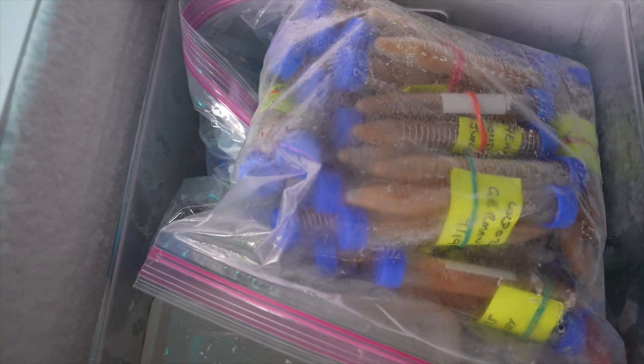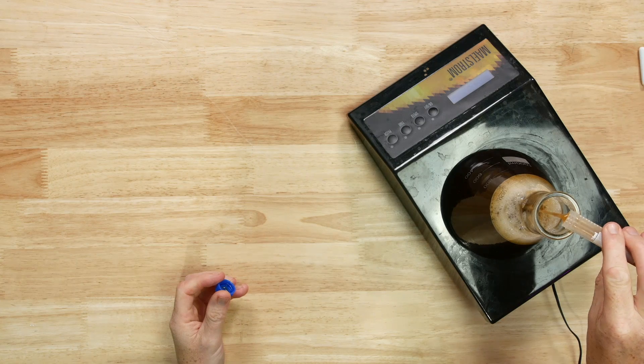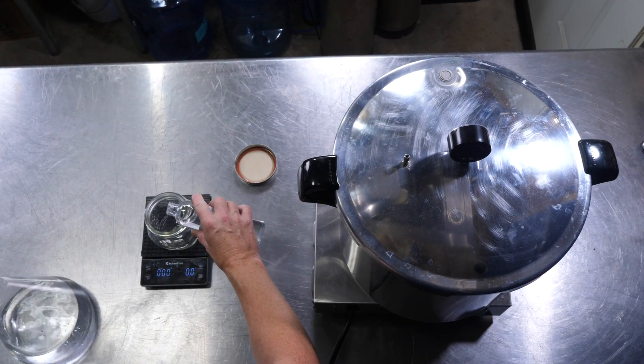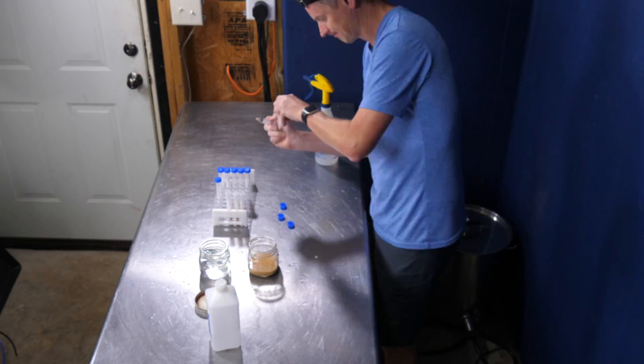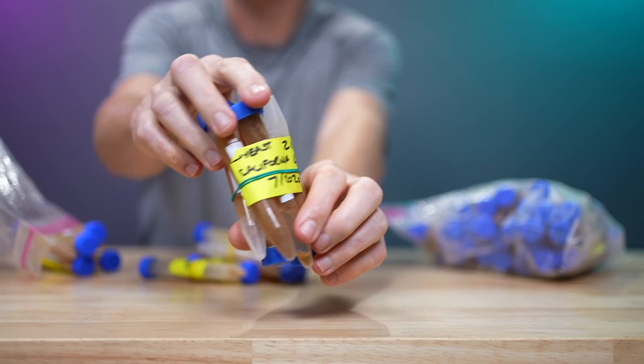Freezing yeast allows you to store it for years, so you'll always have the right yeast on hand for your next brew day. I'm going to show you the entire process and attempt to demonstrate that this really works by reviving a yeast that I froze over three years ago.